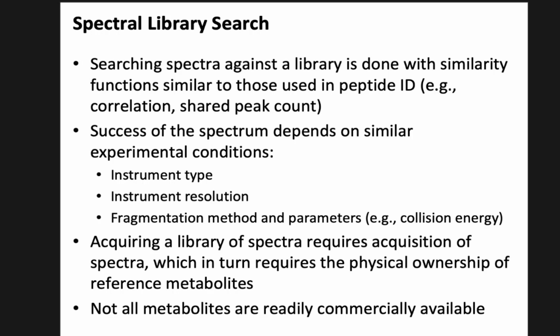Natural product chemistry, if some of you have worked in that, you can spend 3 or 4 PhD students on just getting a partial synthesis of something going. So you can't just buy that stuff. So for many of these compounds, we don't have a reference compound that you could buy. Nobody has it. And that makes it hard to actually get these experimental spectra.